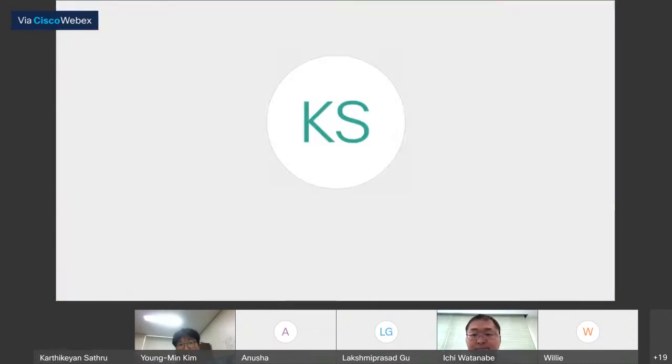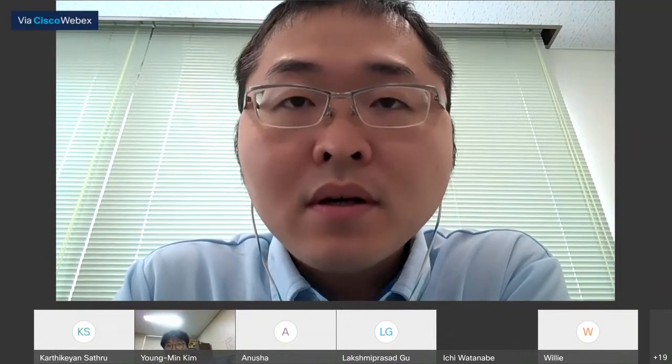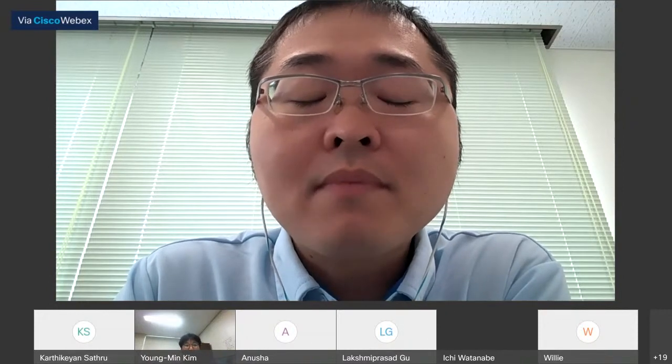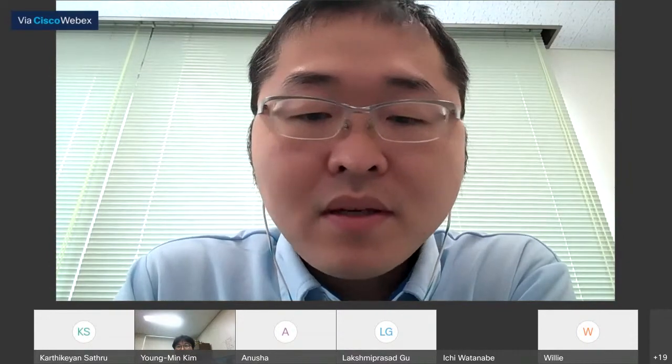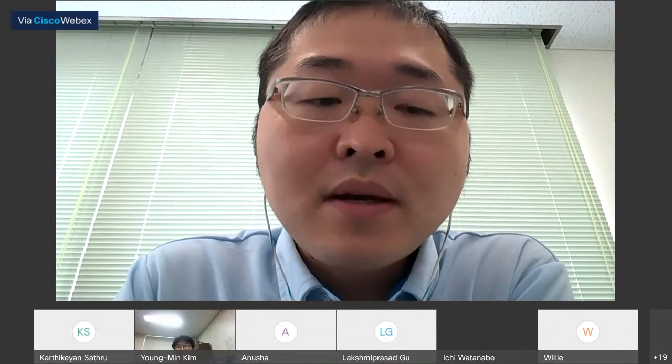Thank you. The next question also, I think, is from IVCR. What is the maximum operating pressure? I think he would have got some answer, but you can actually differentiate the two types of tandem reactor that we have. One is the normal one, the other is the high pressure one. So Ichi-san, can you explain briefly? Okay, for the regular tandem microreactor, the reaction pressure depends on the GC pressure, so usually up to 1 megapascal is the maximum. But that's not a usable range. Usually people use a GC pressure around 100 kPa or something like that. And for the high pressure reactor, the maximum pressure is 3.5 megapascal.